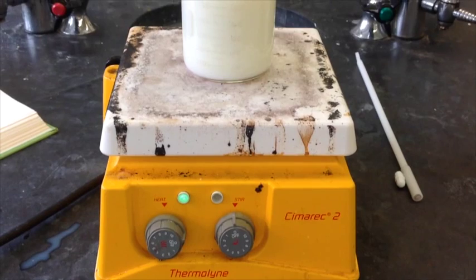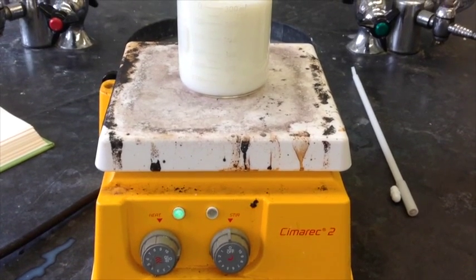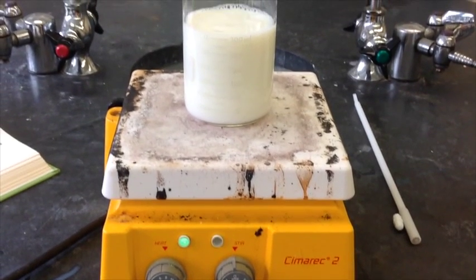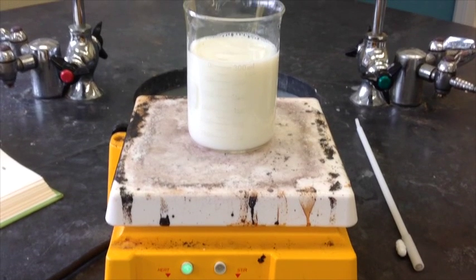Casein is the material you need for this experiment, so I'm going to show you how to extract it. Step 1: Pour 300 ml of organic skim milk into a beaker, then heat until simmering.